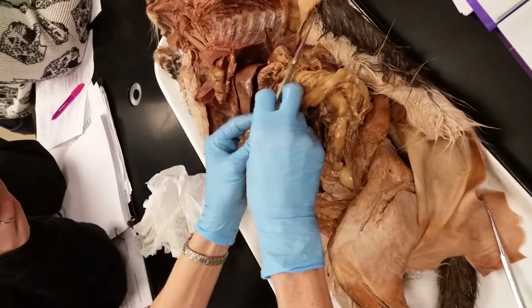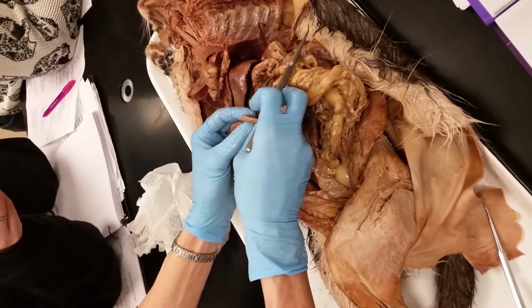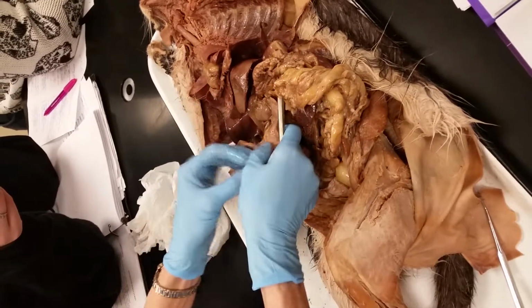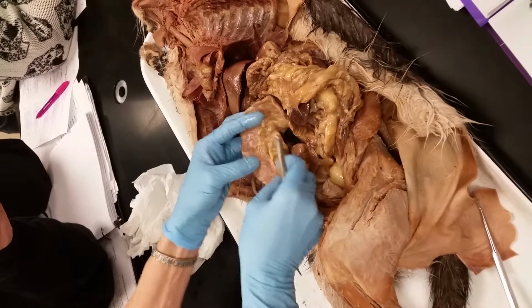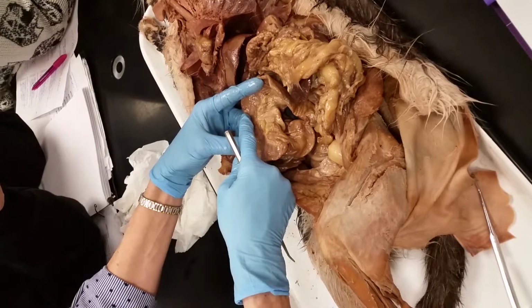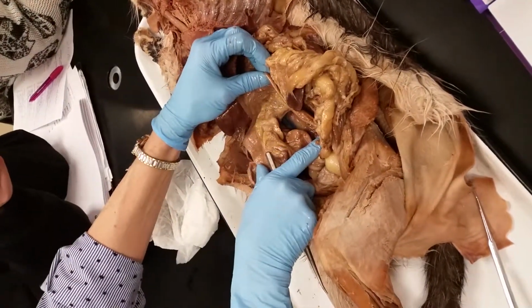Okay? And you also have this little sac right here hanging off out of nowhere. That's the cecum. If this were humans, this is where our appendix would be hanging down. The cats don't have an appendix, they have a cecum. And if we can put this back in somewhat of the right orientation, like so, okay, you would have an ascending colon, a transverse colon, and then the descending colon.